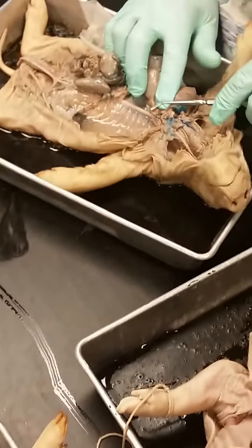Okay, obviously kidney, and you can see the peritoneum here covering the kidney. I'll just peel that off a little bit. And then what is this structure coming out? Ureter. That would be the ureter. And if you follow it down, you notice how it enters this structure right here. So this is the urinary bladder.